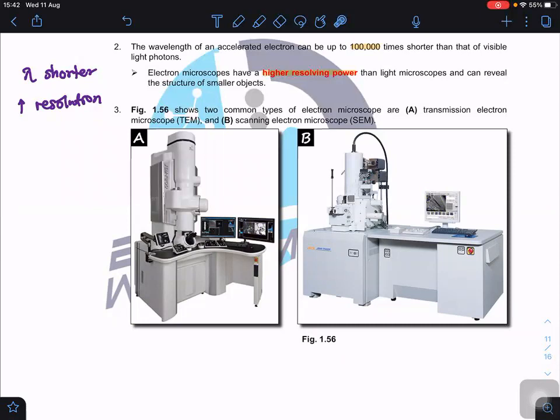If you have gone through your practical in high school, you know the size of the light microscope is roughly the height of one monitor, not so tall. But the electron microscope is the table height, and you put it on another table, so it's very, very bulky, and it requires a clean room.